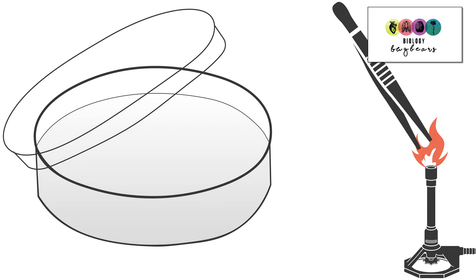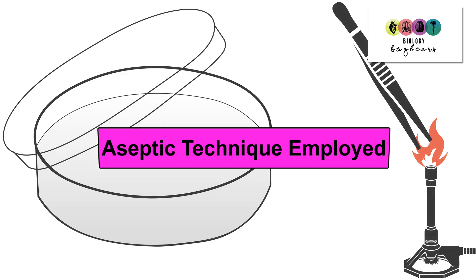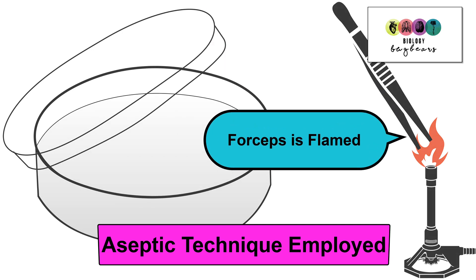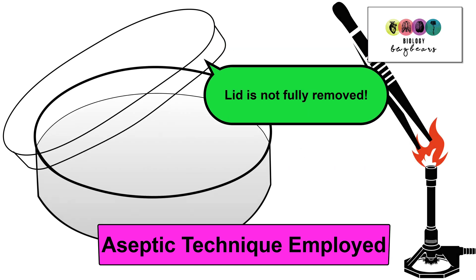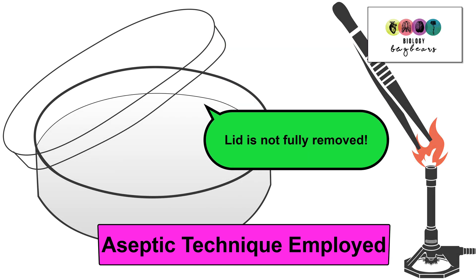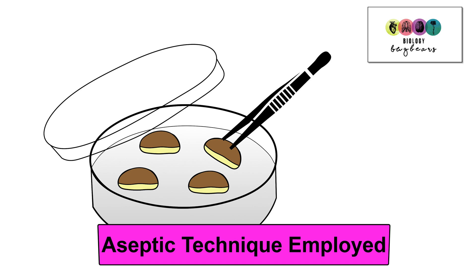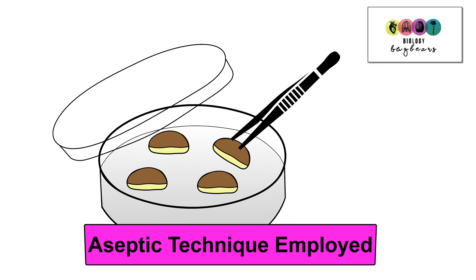We have done everything possible up to now to ensure that we do not introduce microorganisms into our sterile petri dishes. So another precaution is that when transferring the seeds we use aseptic technique. This means that we flame the forceps, which kills any microorganisms on the surface of the forceps, and these are used to handle the seeds. We do not open the lid of the petri dish fully — we open it slightly at an angle and very quickly apply the seeds into the petri dish.